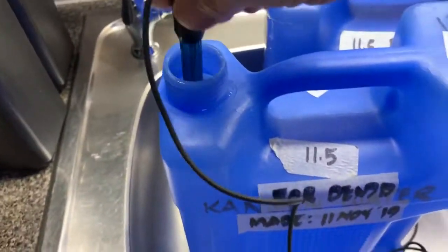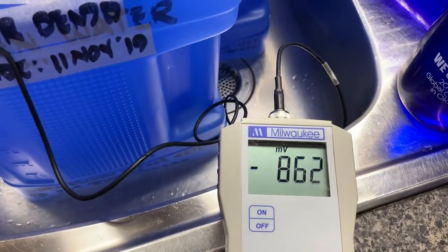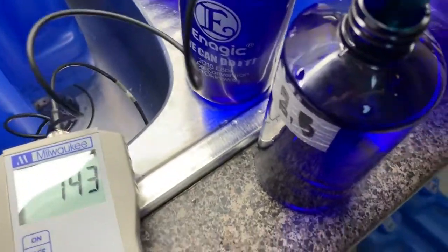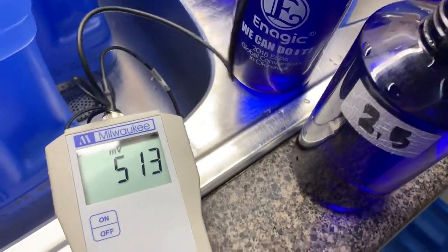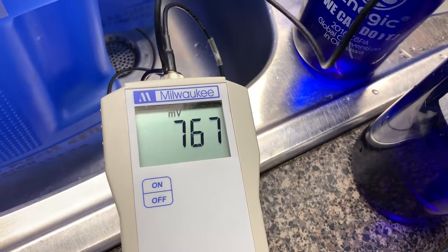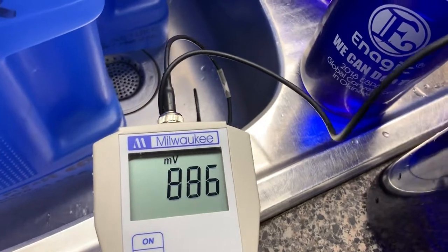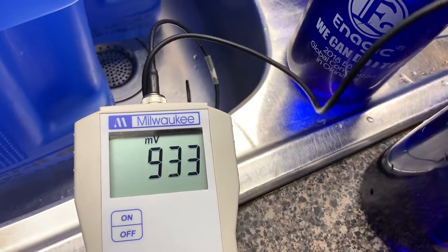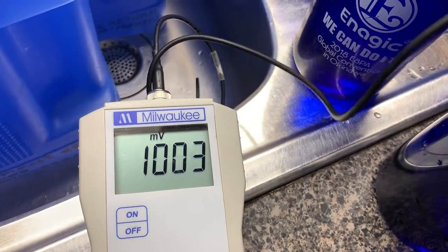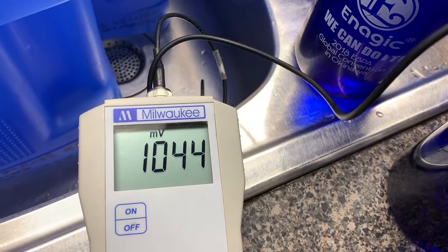As soon as that rod's reading reaches negative 800 plus, switch this rod to the 2.5 and have a look as it jumps to positive 700. Make sure it reaches 1000 plus — 1000 plus at this.